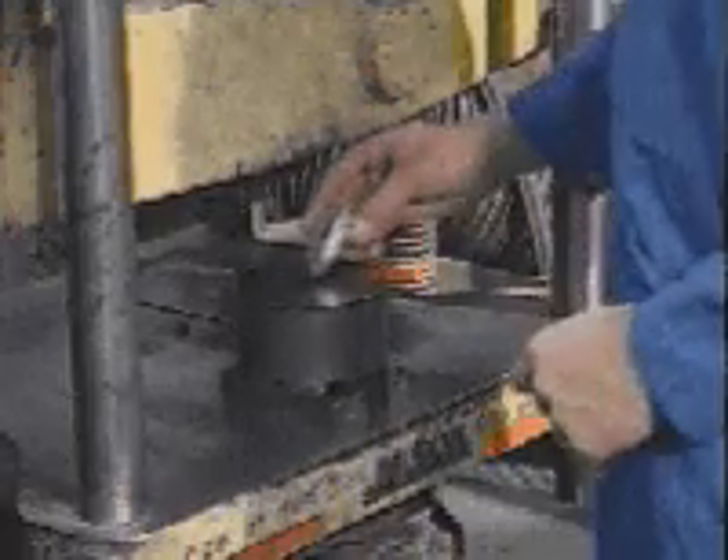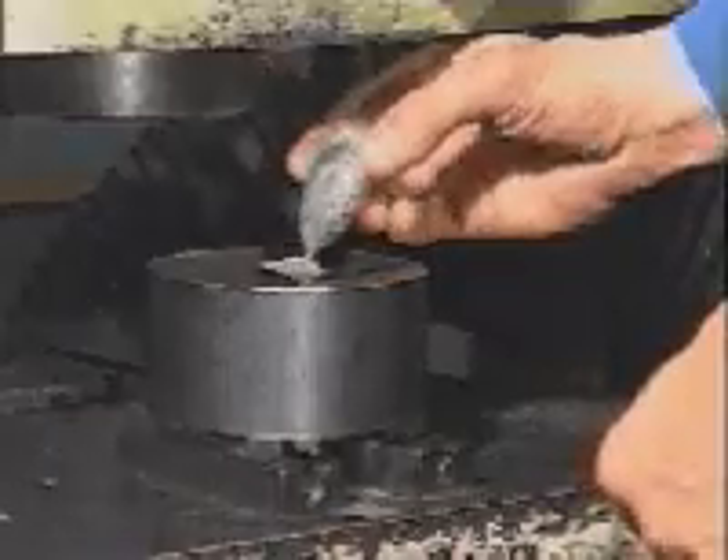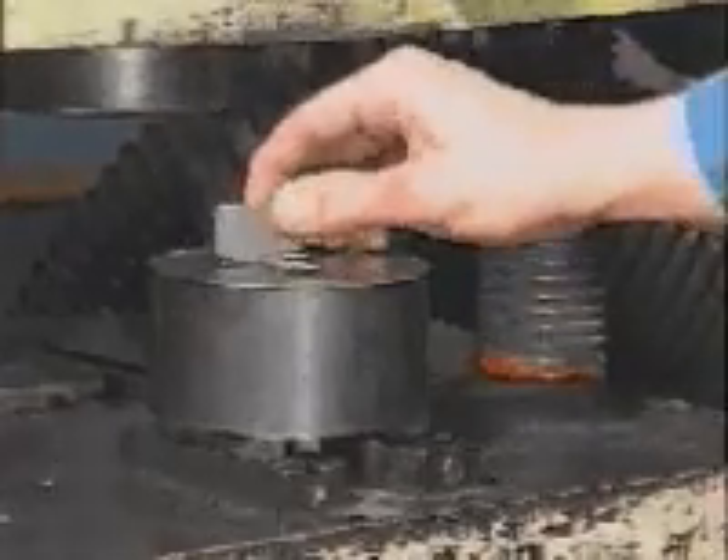Pour the powder sample, obtained in accordance with MPIF Standard 01, into the die cavity. Then, using a non-magnetic straight edge, level off the sample to obtain a uniform distribution.